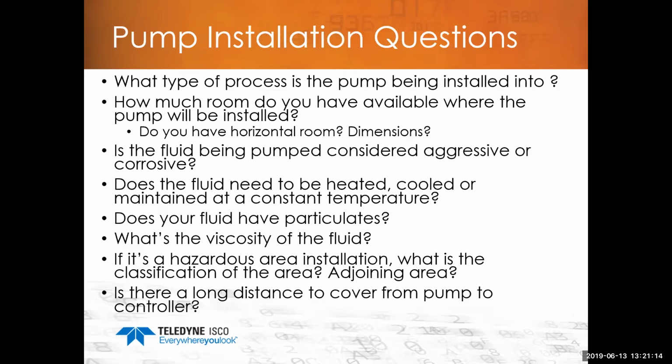Does the material need to be heated, cooled, or maintained at a constant temperature? Does it affect the application or the success of it if the material is not heated? Are there particulates in your fluid? Is it viscous? Those are 2 things that would make you eliminate using check valves, as we talked about earlier. Is it a hazardous area application? What's the classification? Is there an adjoining area? Would you have to specially mount the product somewhere? And is there a long distance to worry about between the pump and the controller? Where are you going to control the device versus where the pump is? Sometimes people have controllers in other rooms, and that's something you need to understand.